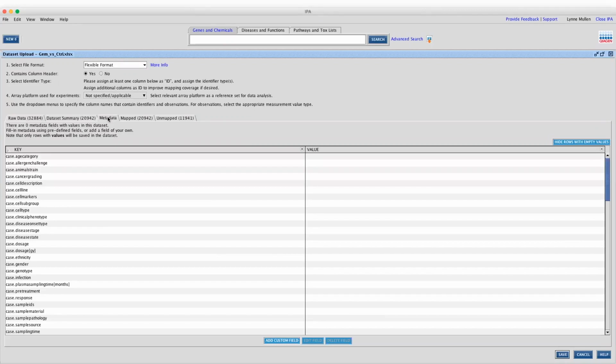The reason that we think it's really helpful and we included it is, first of all, when you go ahead and do searches later on in that project manager, it's really nice to have the metadata option. If you have analysis match license and you're looking for everything associated with coronary disease, for example, then it will find that, and it can also find your data set that was associated with coronary disease. And the other thing it's good for is these are the same key terms that we use in analysis match, so it's a lot easier to filter your data set if you stay consistent.